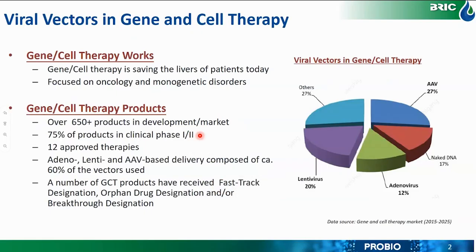Gene and cell therapy is a type of personalized medicine that can treat a number of diseases for which traditional treatment methods are not effective or cannot be applied. Plasmid DNA and lentiviral vector are widely used as delivery vehicles in GCT products, but process development and manufacturing of plasmid and viral vector are facing many challenges, such as high cost, lack of clinical grade suppliers, scaling up, and low yield.